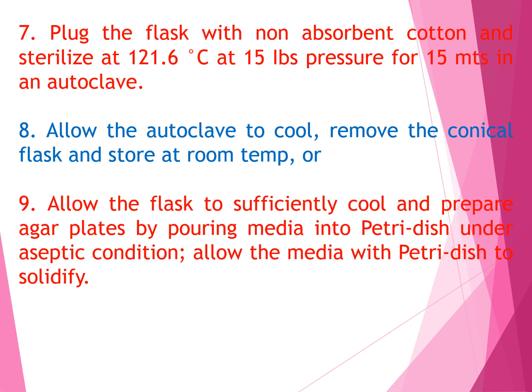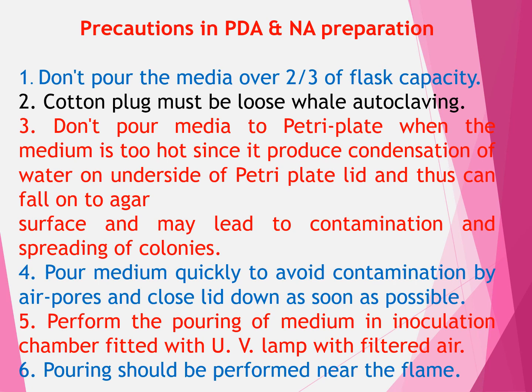So now what are the precautions one should keep in mind? First, don't pour the media over 2/3 of flask capacity because it will be problematic when you reboil the media for further use. Next, the cotton plug must be loose while autoclaving. A too tight cotton plug may create extra pressure and the flask may break.